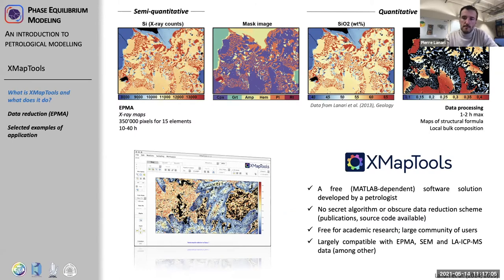It is a problem, but I would say for the calibration it's not really a problem, because in the end the composition will be between a pyroxene and a plagioclase. So it will be a mixing composition even on the map at the end. So I think we do a pretty good job in the calibration. Okay, great. Thanks, Pierre.